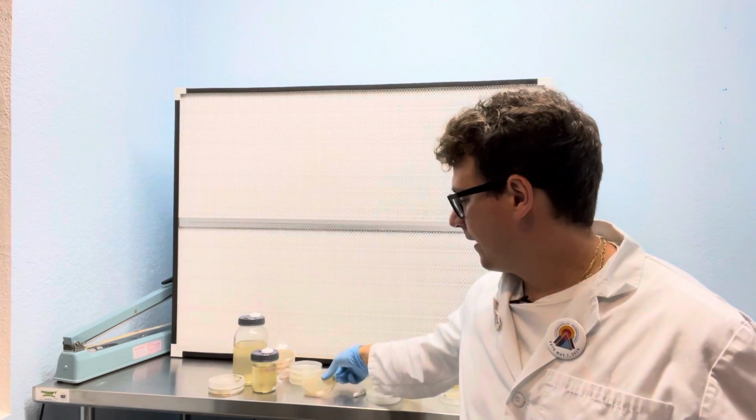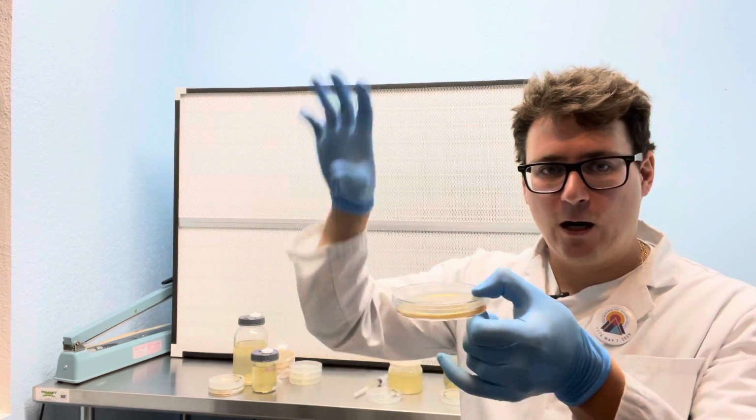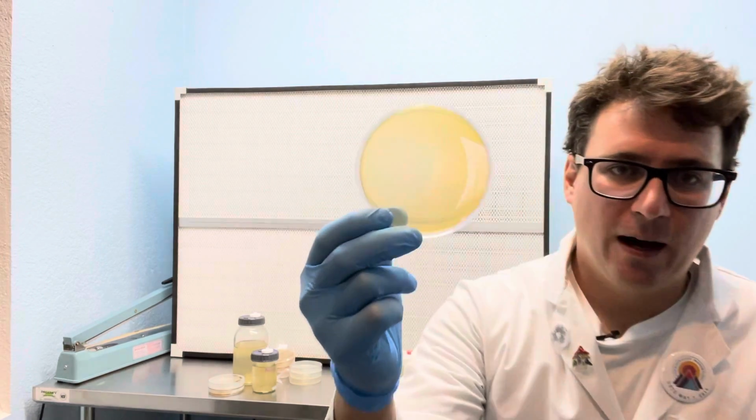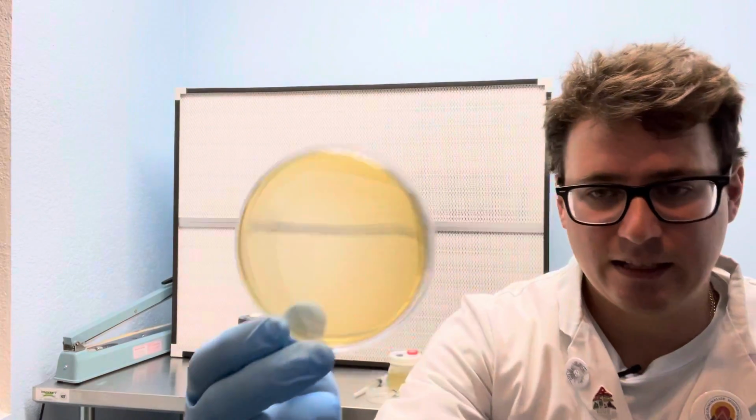This is going to kill any microorganisms that might otherwise be present, and then we'll pour it onto sterile petri dishes and let them cool. These are about a week old, and you can see right through them very easily.